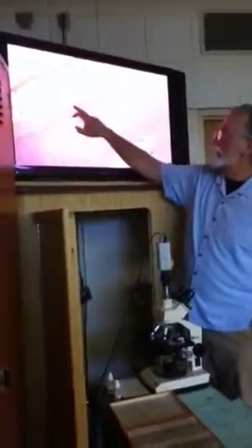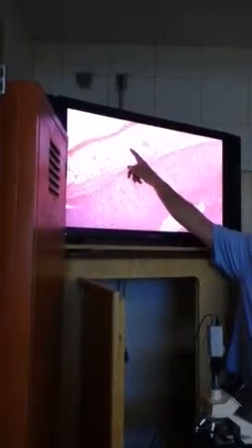Now, is this the capsule or is that the capsule? The first one. This is the capsule. What's this? This is the capsular adipose, a protective mechanism that is around the kidney. Because this sits right on top of the kidney. Okay, here we go. This isn't bad. So you can see the capsule, 1 layer, 2 layers, 3 layers, and then this very thin area in between here is the medulla.